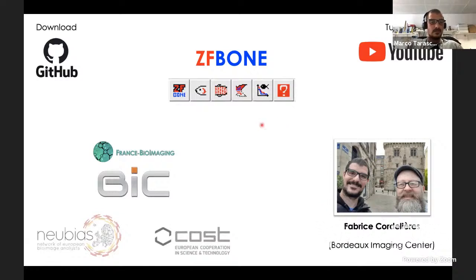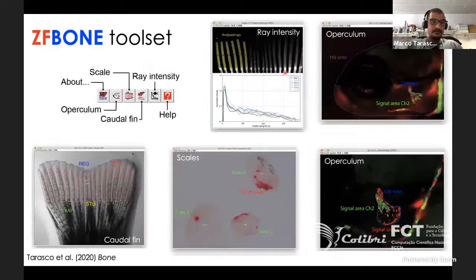We started talking about macros, and I could then apply to a COST Action to go and visit him in Bordeaux, and together we developed ZFBone, a toolset made to assess all the systems I just showed you. ZFBone is freely available on GitHub, and we also made some YouTube tutorials for people that are using it for the first time, to see how each tool works.